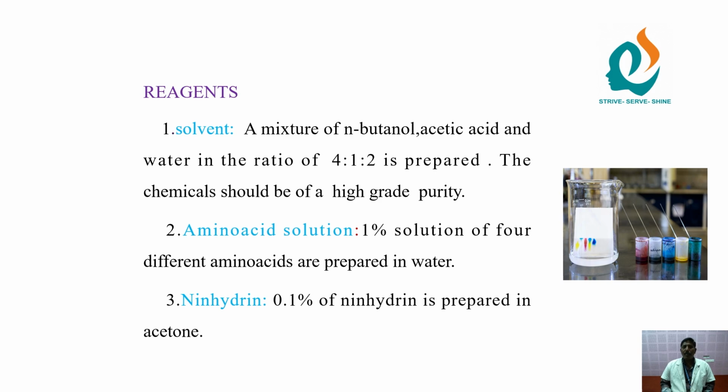Next, reagent preparation. First one, solvent. A mixture of N-butanol, acetic acid and water in the ratio of 4:1:2 is prepared. These chemicals should be of high grade purity. For example, N-butanol 4, acetic acid 1 and water 2. It is dissolved and made up in the ratio.